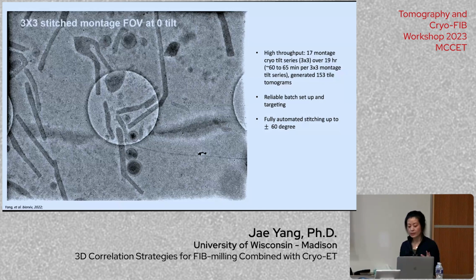And we wanted to just use the regular tile tomograms, and it's more efficient than the big one. One thing about the other method that we also encountered is that the fully stitched one is gigantic, so it takes forever to run any process, even to extract the particles. But if you use a regular one, it is much faster.